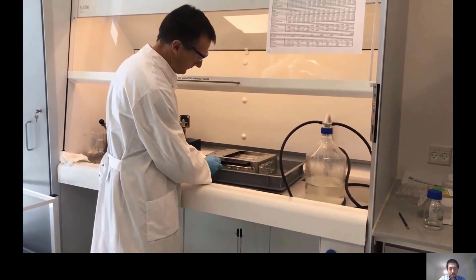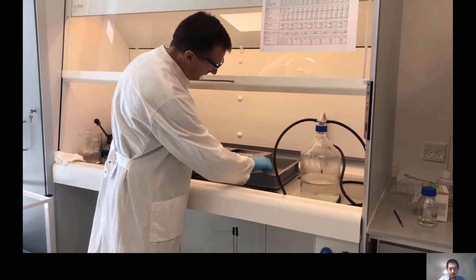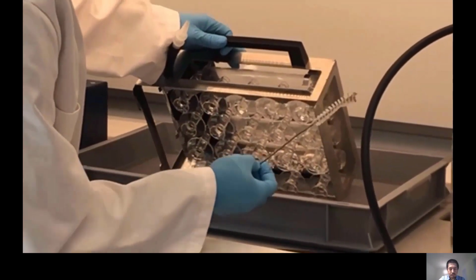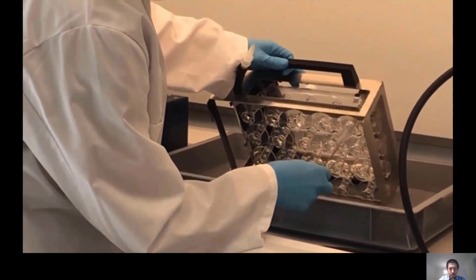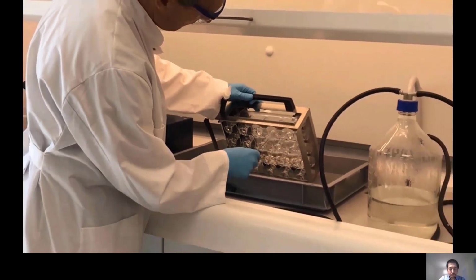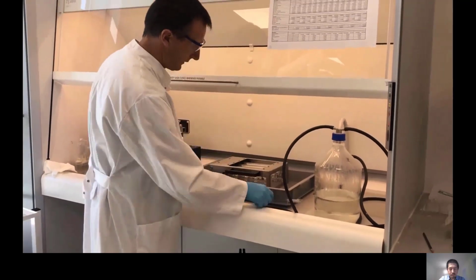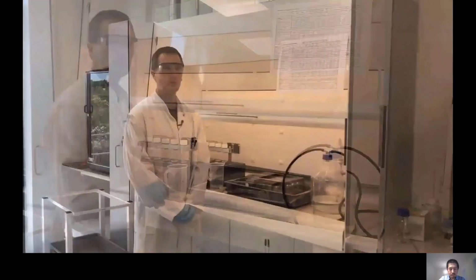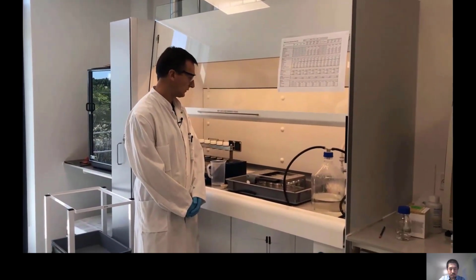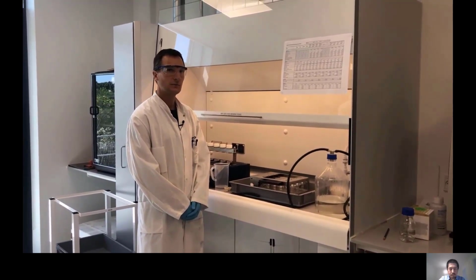You can disconnect this one here. And then if any leftovers are not removed, you can use this small flask cleaner and take out the rest here. And of course you can do that for each manifold and then do another cleaning. When you're done cleaning, you can take out the exhaust and let it dry until the next analysis.